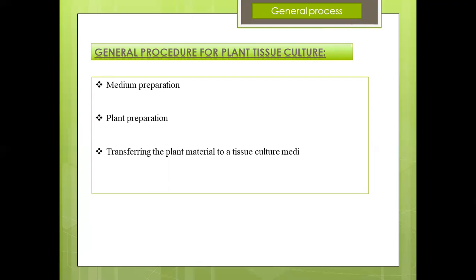Plant preparation. Cut the plant part into small pieces. On the other hand, some parts such as African violet leaves can be used as a whole. Using detergent and water, wash the plant part for about 20 minutes. Transfer the plant part into sterilized bleach solution. Shake for a minute and leave to soak for 20 minutes. Using a lid, gently discard the bleach and retain the plant part in the container and then cap the container.